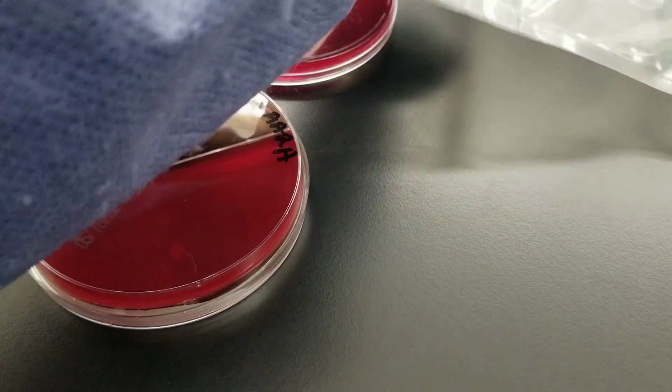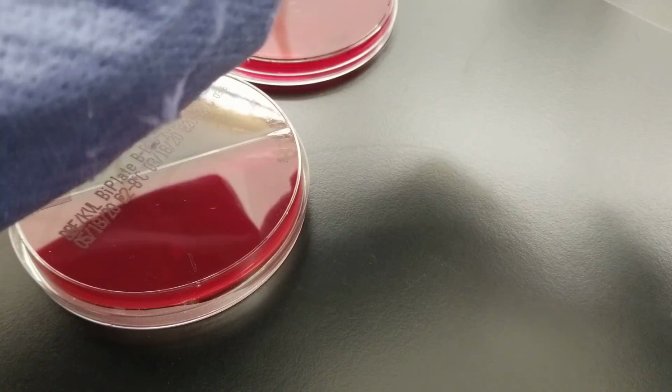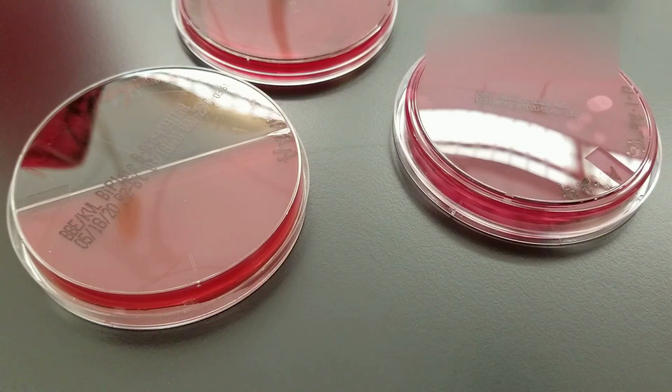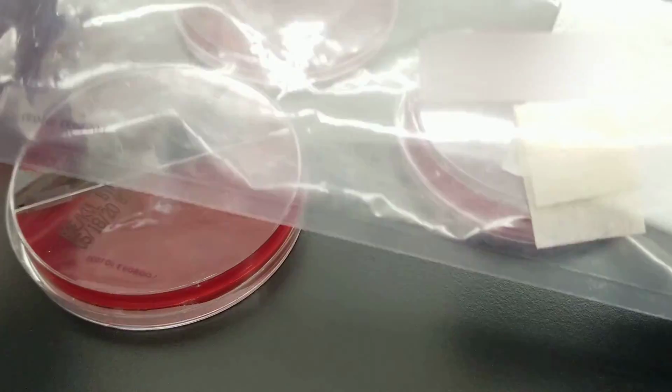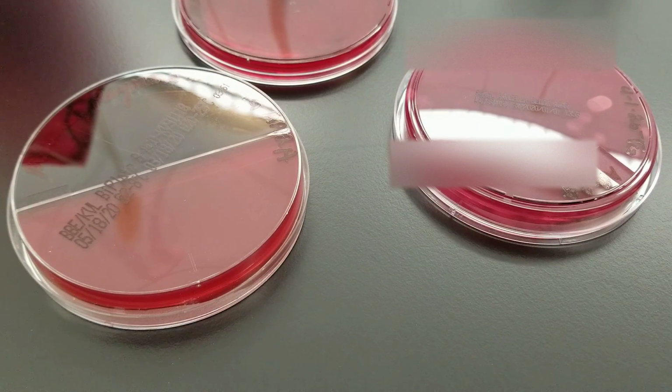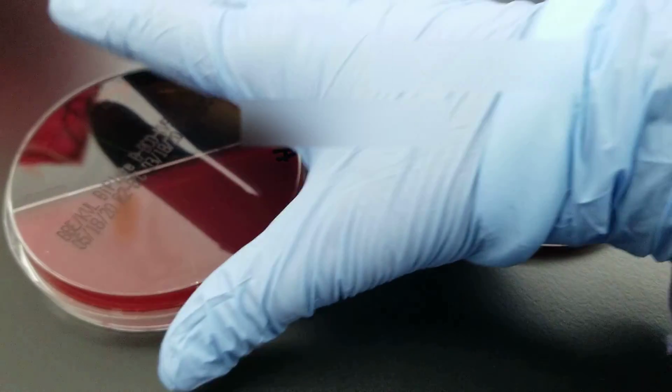Okay, so we have the 3 plates that we had in the anaerobic setup. We're going to get rid of the gas pack and the indicator that we had previously. It's of no use anymore. Everything has been brought to room temperature, including the new plates that we're going to use. So let's look at these plates.